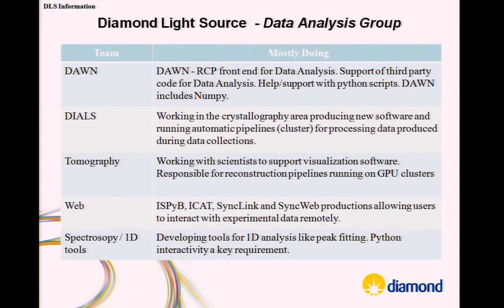The data analysis team, I don't know if some of you will know this because I have only talked about Dawn previously, is actually not just Dawn. We do lots of other things. One of them is called Dials, which is in the area of crystallography. So when people come along and take their data on a beamline, we'll actually run algorithms on a supercomputer to reconstruct their molecule. There's a very nice video of this on the Diamond website at the moment. That's based in Python, but we trigger it from our GUIs or from our servers written in Java, but actually that's purely a Python product.